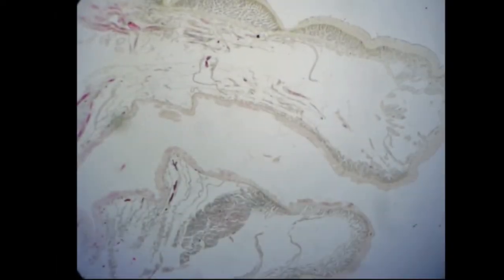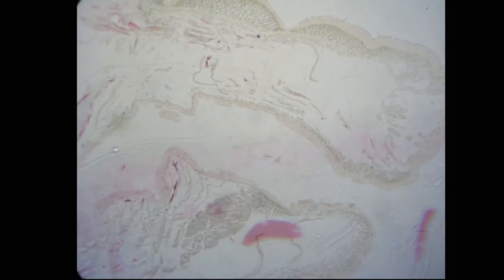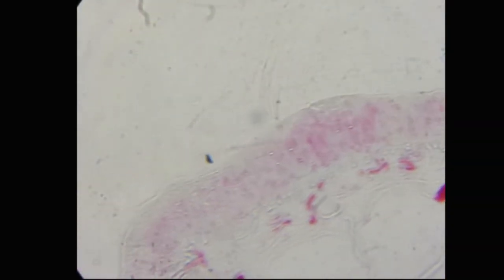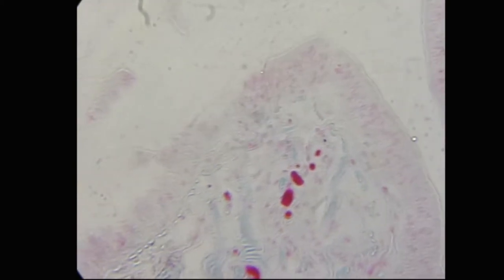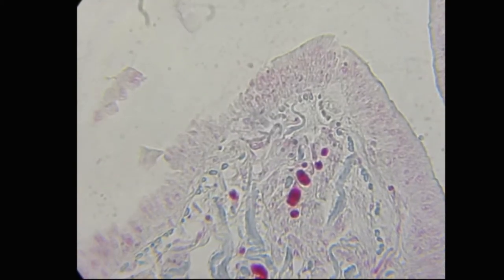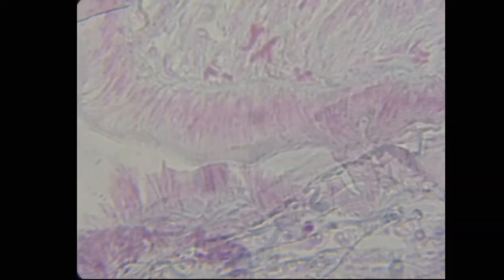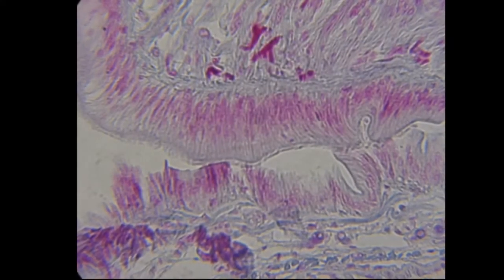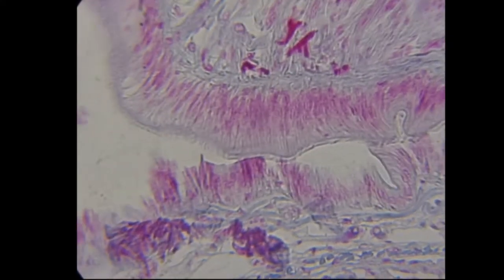Moving caudally we can see the earthworm's mouth occupying the first three segments, which it uses to prehend food. The epithelium is very similar to that of the skin, but if we look closely we can appreciate that there are fewer goblet cells and no albumin cells within the mouth. As we move caudally the nature of the epithelium begins to change. Suddenly the cells have cilia on their surface. This means we've reached the pharynx.